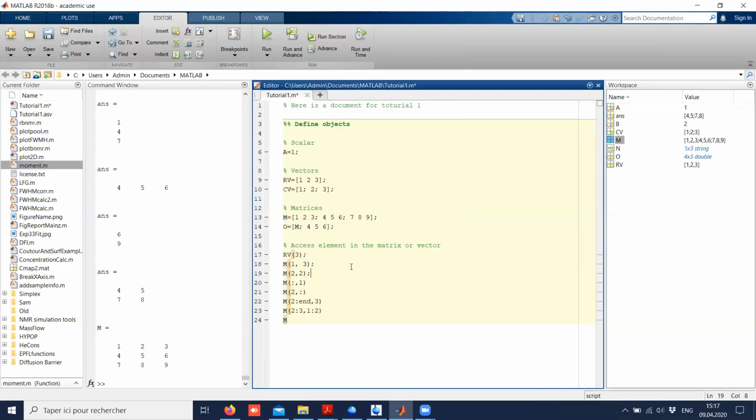So these are just a few examples. Now I comment this. But we can also define more complicated objects that are called arrays. So for example, I can create... for this I will need, before I introduce arrays, I will introduce a few useful functions.